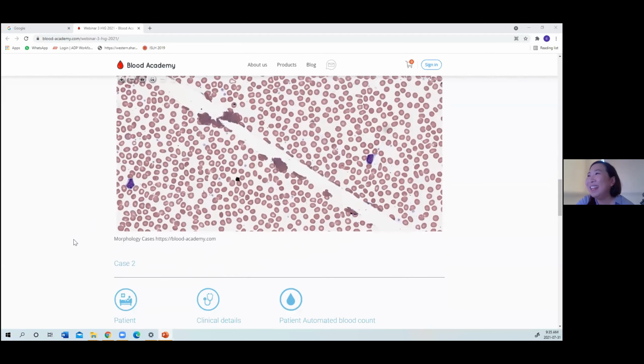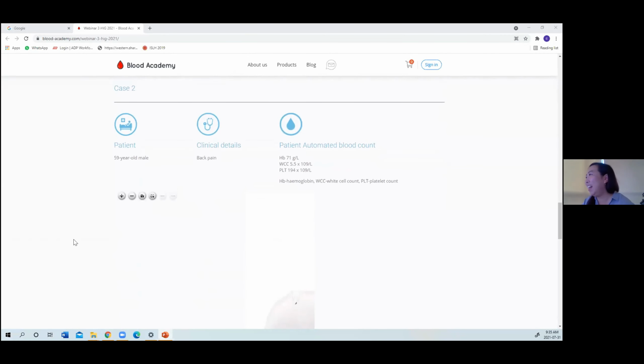Excellent. Thank you, Audi. That's a great start to the webinar. You've answered all the questions that I wanted to ask you, and I think you really highlighted the point that flow cytometry is essential in the diagnosis of lymphoid malignancy.